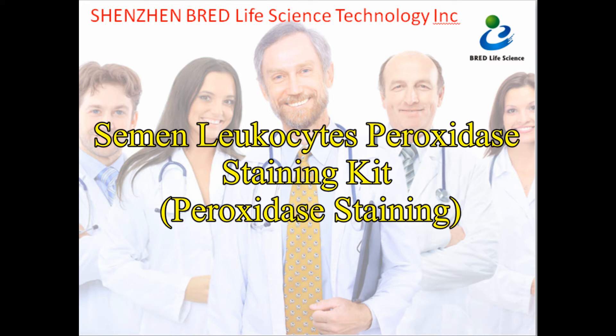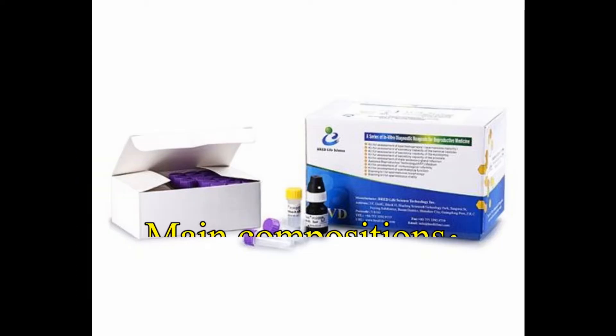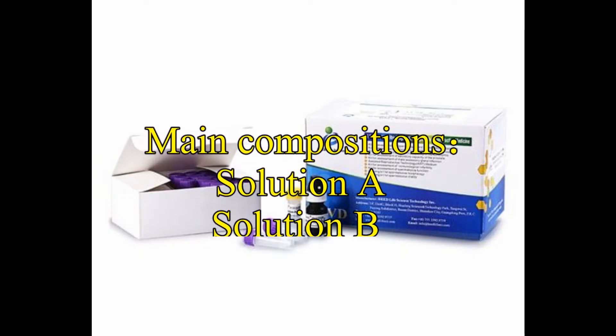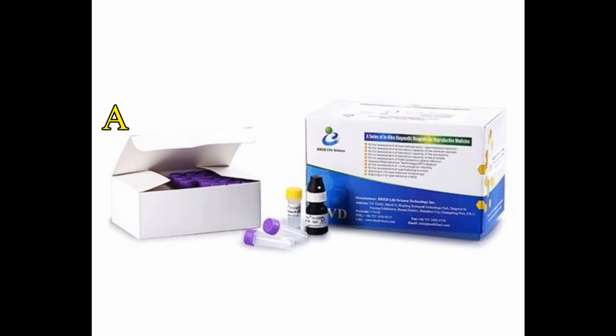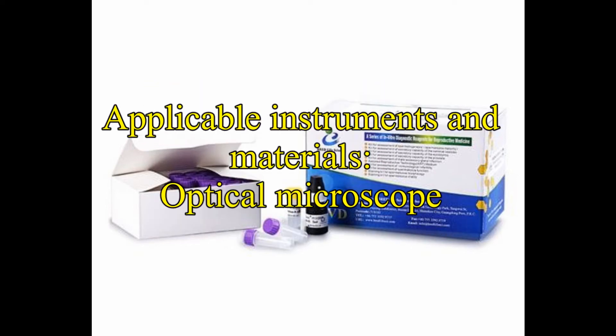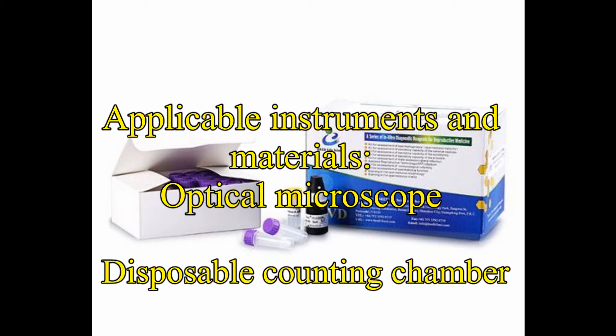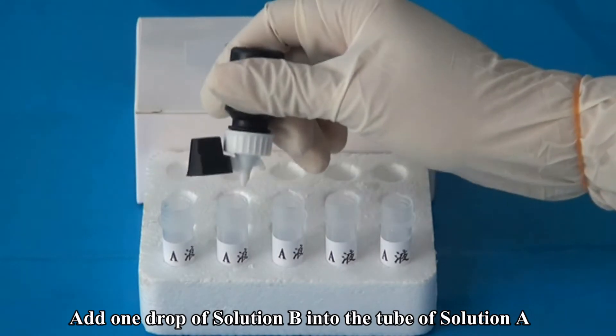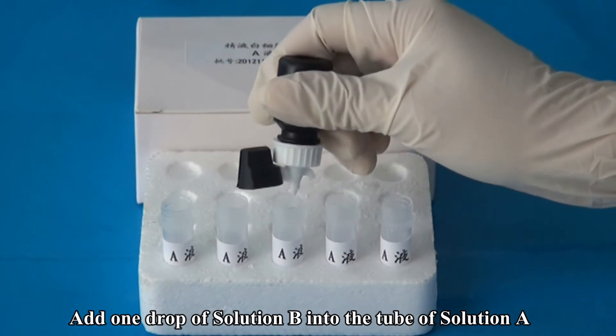Semen Leukocyte Peroxidase Staining Kit. Main compositions: Solution A, Solution B, HRP Control Solution. Applicable instruments and materials include an optical microscope and a disposable counting chamber. To begin, add one drop of Solution B into the tube of Solution A.